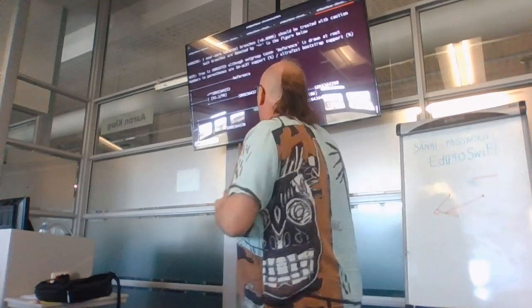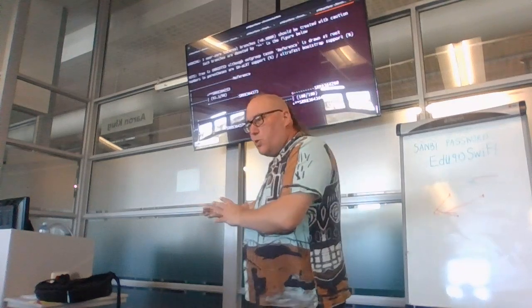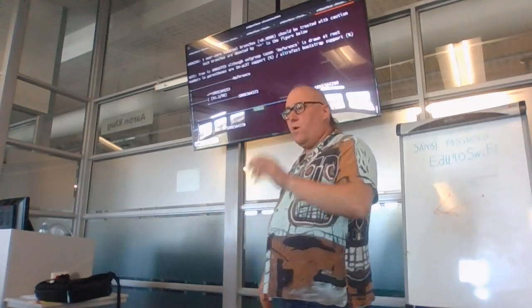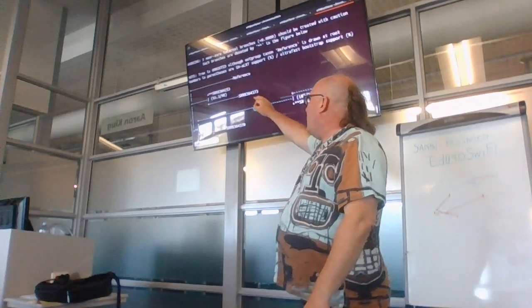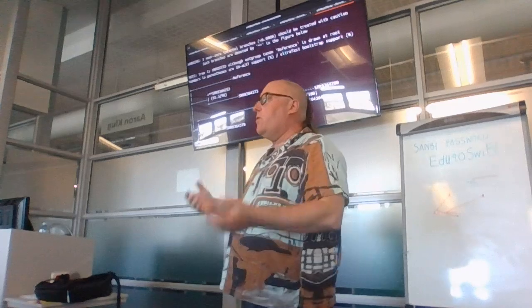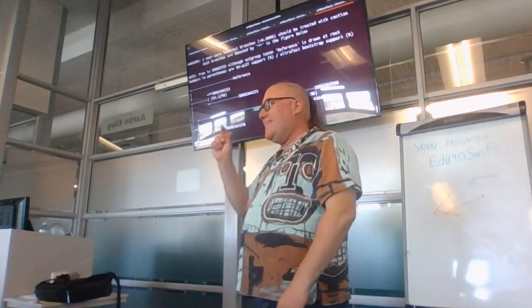It says this tree is unrooted, but basically what you do is you use the outgroup to give a direction to your tree. So in our case, remember that the reference is a sample collected early on in the history of cholera in Haiti, then we know that all of the other samples are more evolved. The evolution has a distance. But remember that maximum likelihood methods are only working from the genetic code.